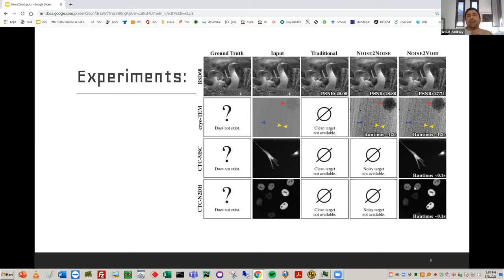Yeah. And the second experimental solution that we could have tried is to take multiple images of the same thing and average them together, and in principle they could get a cleaner image. Actually, they could also get the distribution of the noise from that. And I think they did something similar in CARE. So anyway, that's another possibility.